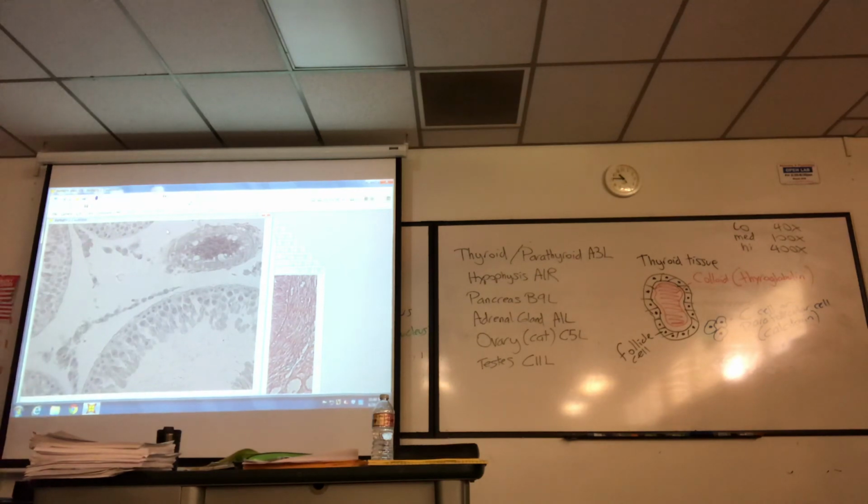I will post all of these images by this afternoon on Canvas, okay? So you can study them for your histology quiz on Friday. Question? Will you point out the tubules again? The what? Yeah, seminiferous tubule. There's an edge of one there, there's an edge of one there. Okay? Class dismissed. I'll see you Friday.